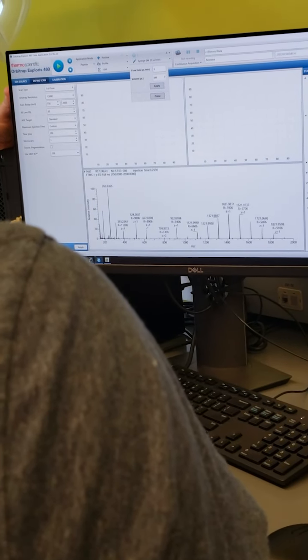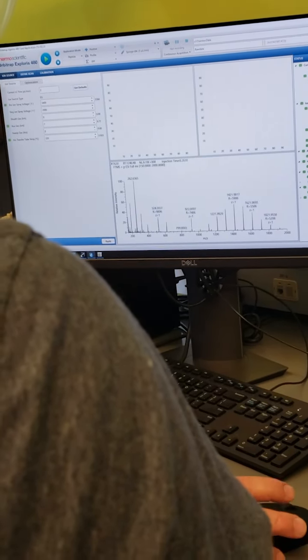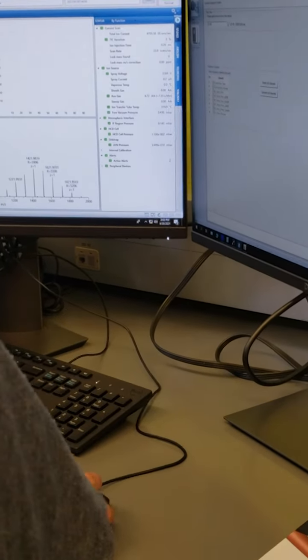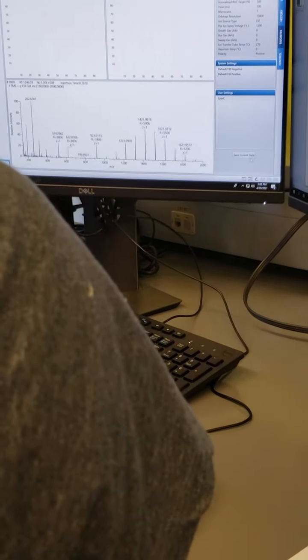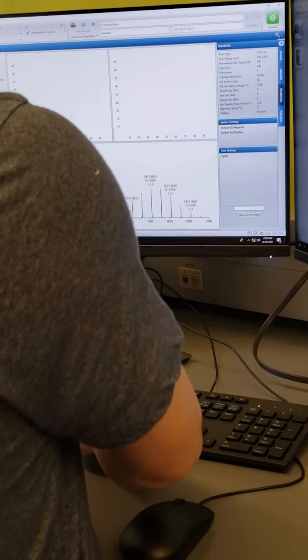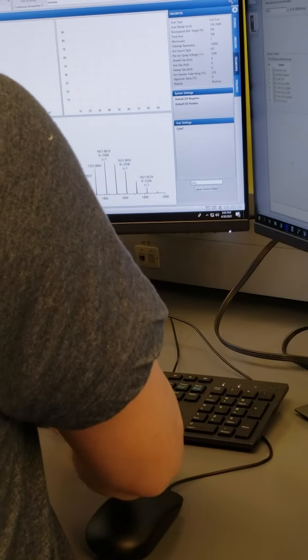So what we're looking to see here on an ion source setting is this, and I would recommend that you create, I'll show you that. If you go to favorites, okay, so I would say save current state. Okay, and then give it a name. Call it ESI POS training, and then today's date, or whatever way you want to call it. You go ESI training and then today's date.